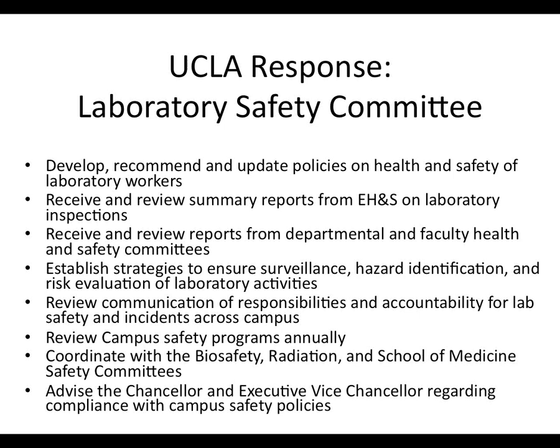And most federal and state laws have a primary focus on health safety issues, but it's also important to recognize that chemical safety and chemical exposure can lead to problems other than internal health. But there are also things like physical hazards. So a fire is a physical hazard. Lasers and loud noises and cold temperatures, hot temperatures are physical hazards. And so the Laboratory Safety Committee is going to be reviewing all these other areas and how PPE can prevent injuries to workers due to physical hazards in addition to chemical hazards.